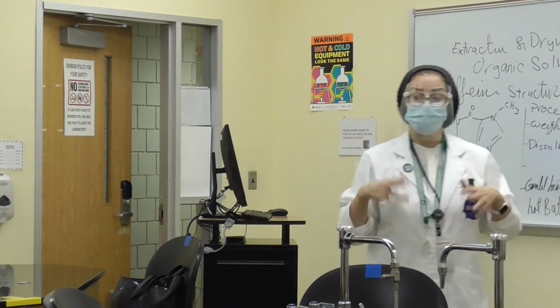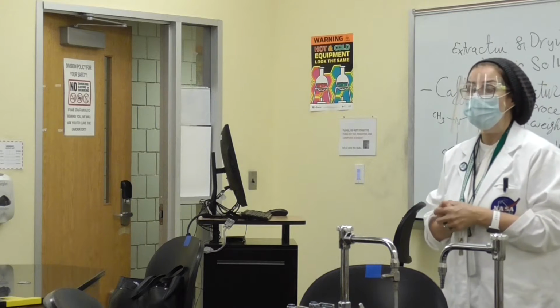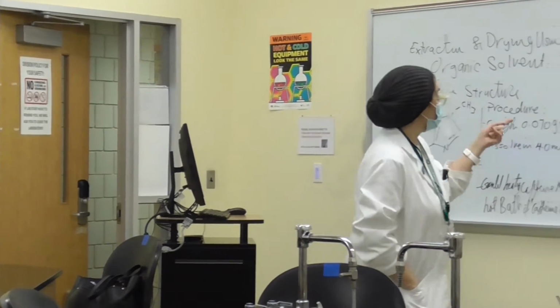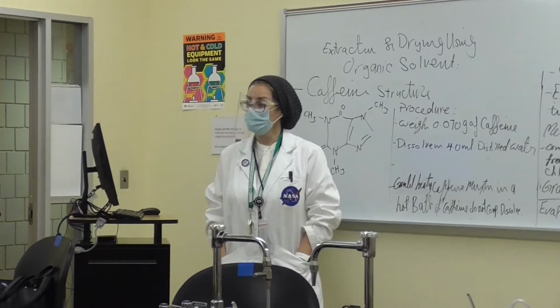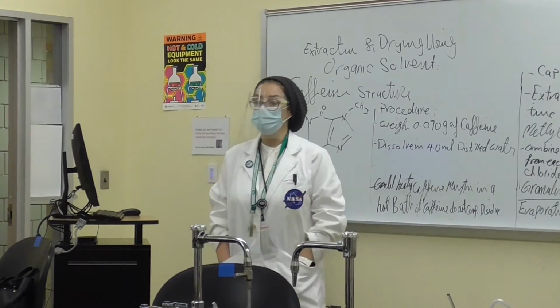The reason why we're going to do this 3 times, can somebody tell me why? Why do we have to do it in 3 times? It says here 3 times with a 2 milliliter portion.